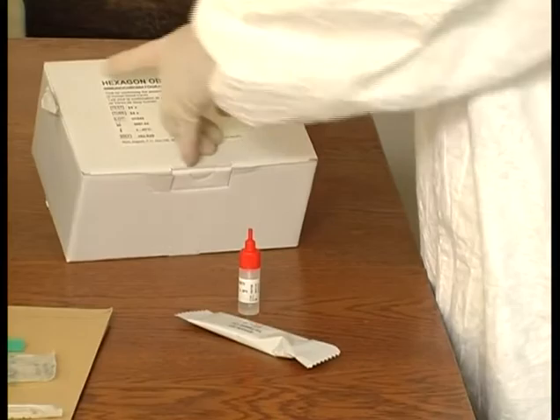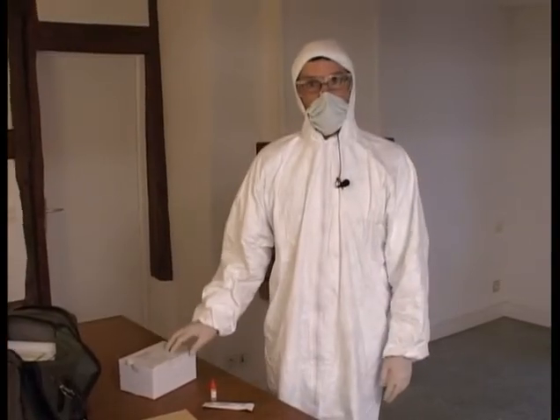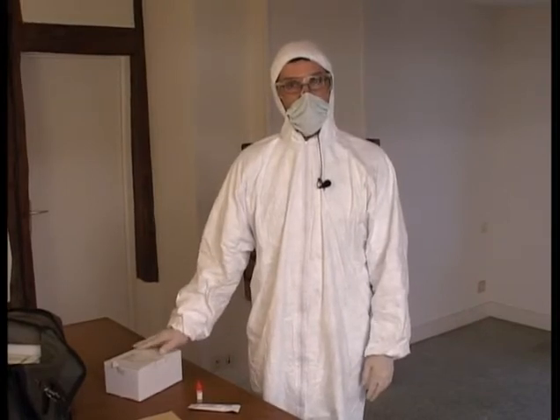Hexagon OBTI is an immunological test that can distinguish human or primate blood from all other animal bloods.